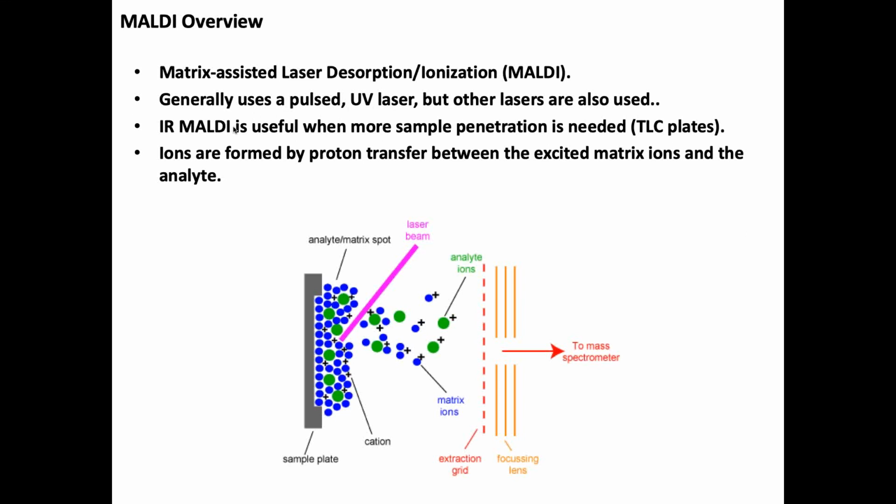IR lasers are 10 or more times as expensive as a UV laser off the shelf. Most people are like, that's just too much. Now IR lasers are coming down in price, and ionization can be improved again with post-ionization techniques and other things. So it's maybe coming back. Who knows? We'll see. But it also probably taps into maybe some other carbohydrate.